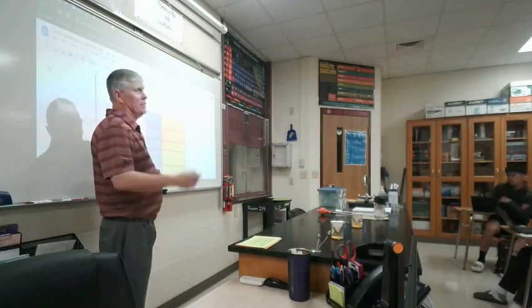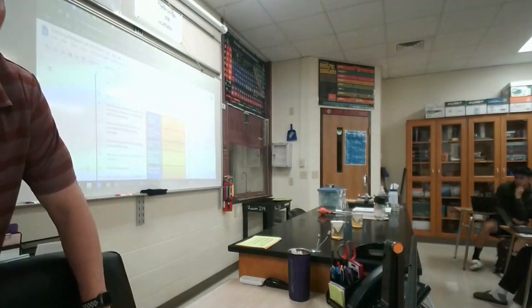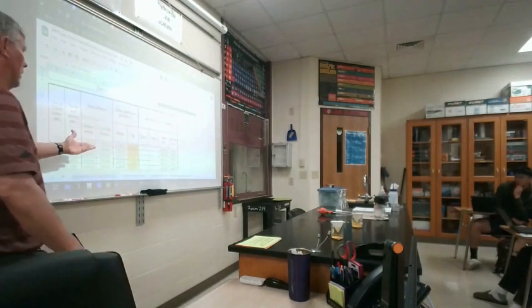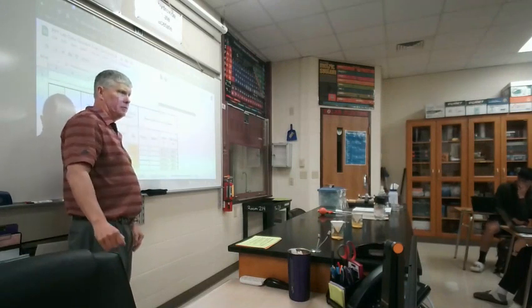will give me the mass of the dry lead iodide only. That is the one that you are trying to find. That is the one that you will put into this table tomorrow. The mass of the dry sample only. Questions?